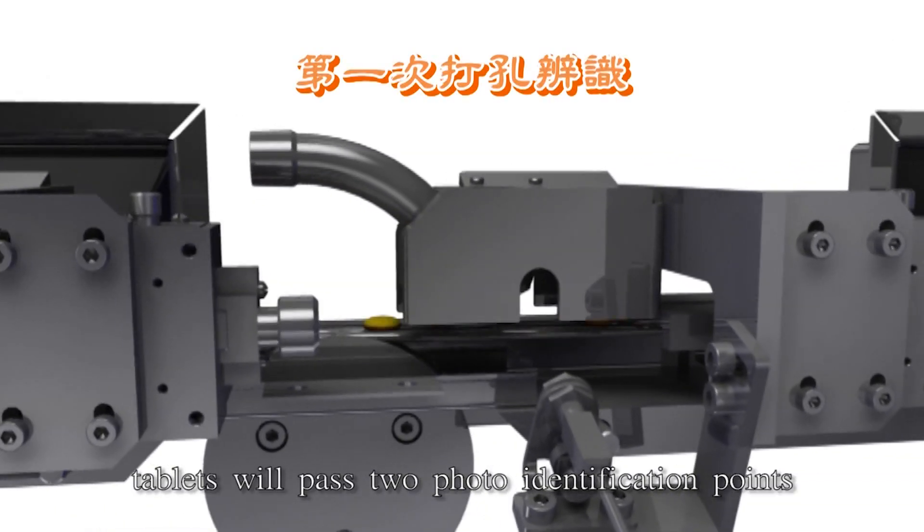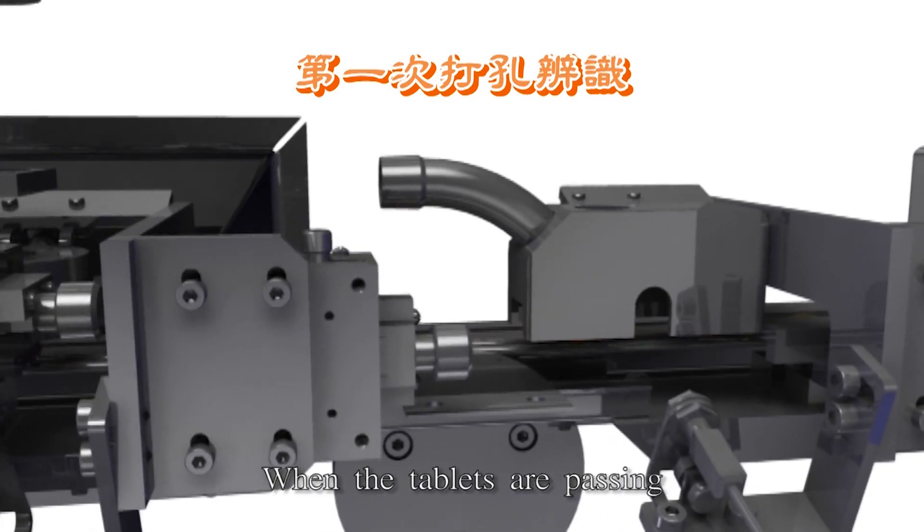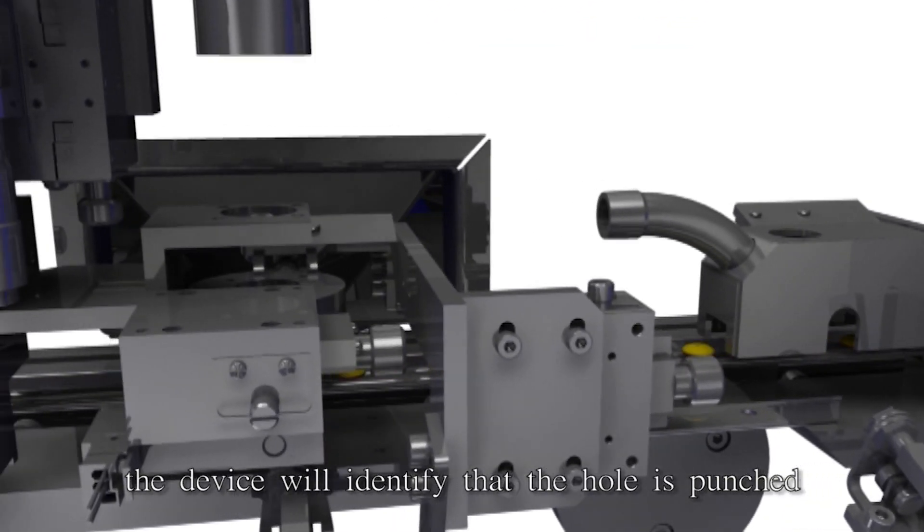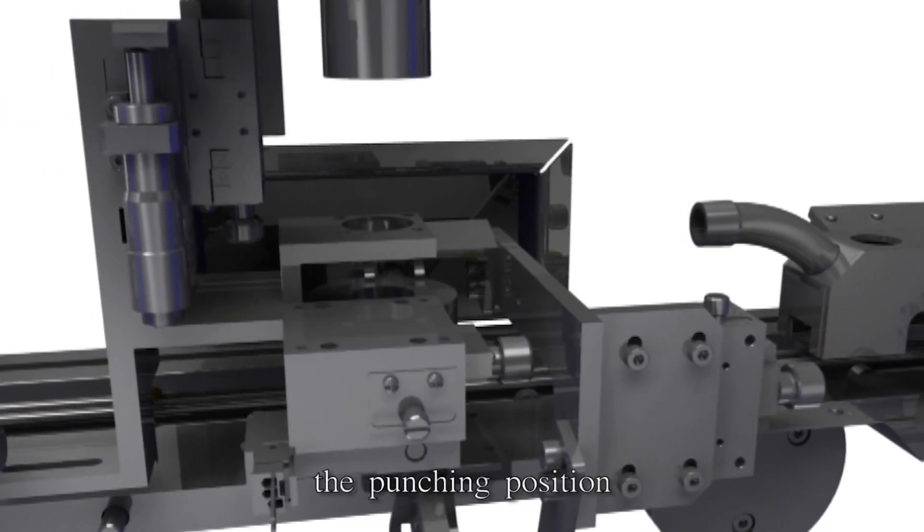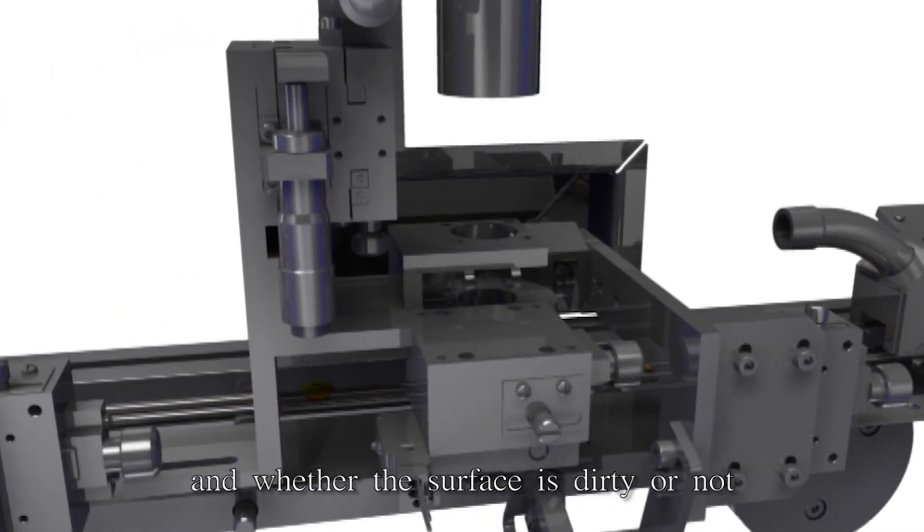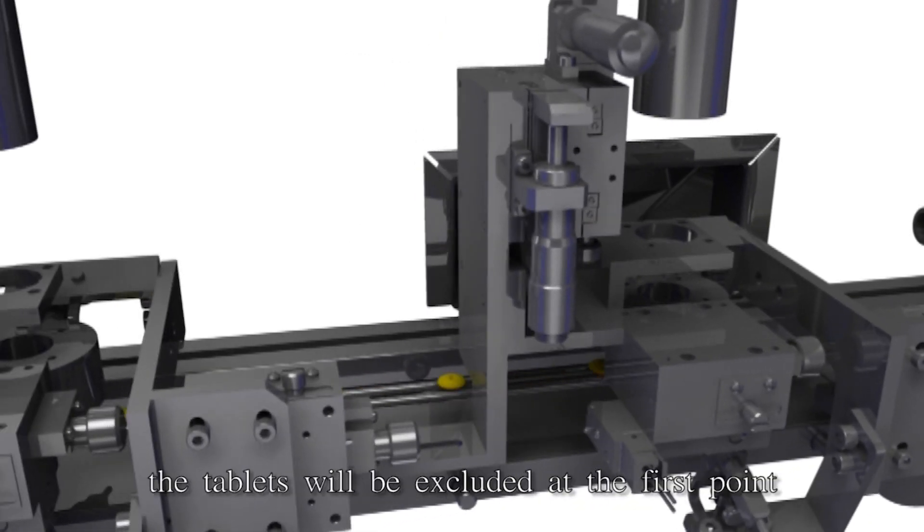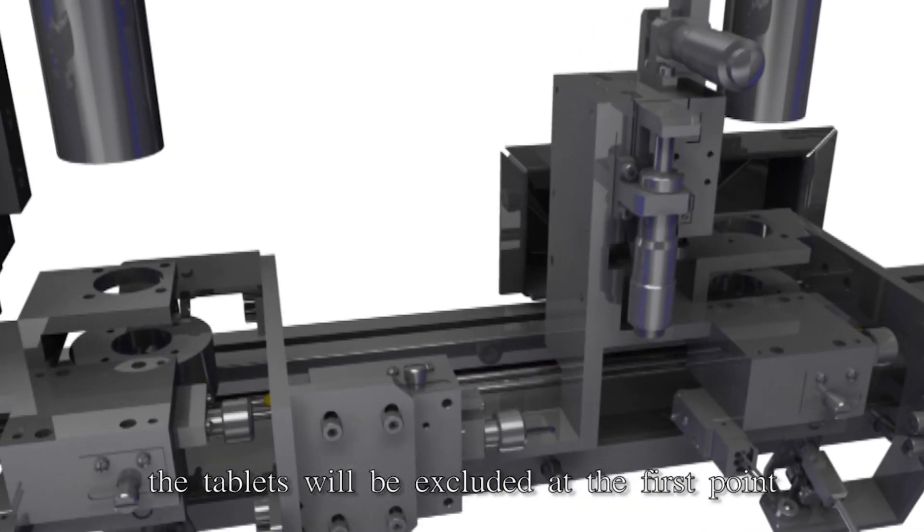Finally, tablets pass two photo identification points. When the tablets are passing the activating device, the device identifies whether the hole is punched, the hole size, the punching position, and whether the surface is dirty. If the first identification fails, the tablets are excluded at the first point.